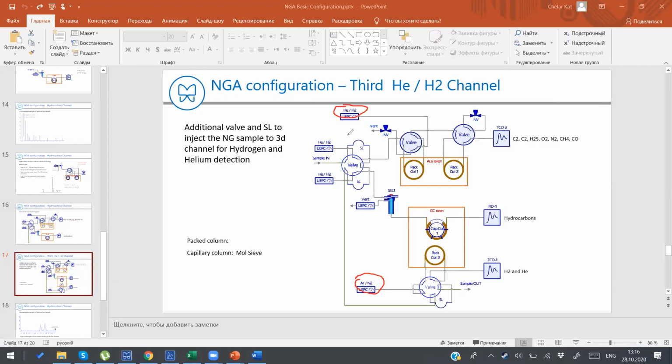One of the benefits of a different carrier gas is the difference in thermal conductivity. Oxygen, nitrogen, and even argon have very similar thermal conductivity, so we cannot reach very good detection limits if we have the same carrier gas and reference gas in the TCD with similar thermal conductivity. But there is a very big difference in thermal conductivity between helium and hydrogen compared to oxygen and nitrogen.